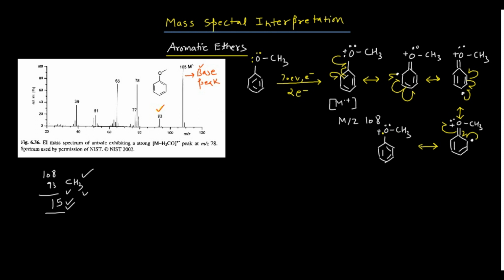So how can I break this bond? This bond will break. One of the electrons will go to the methyl group, and the other electron will shift onto the oxygen atom, and then you will get your next structure, and it would look like this. See, minus CH3 I am writing here in the form of the radical, and then you have this. Now this oxygen, see, one lone pair was already there, and now you have another lone pair on it, right? How am I getting this another lone pair?